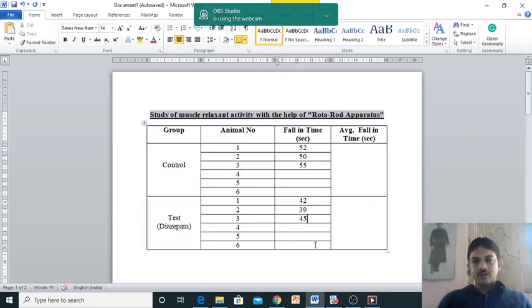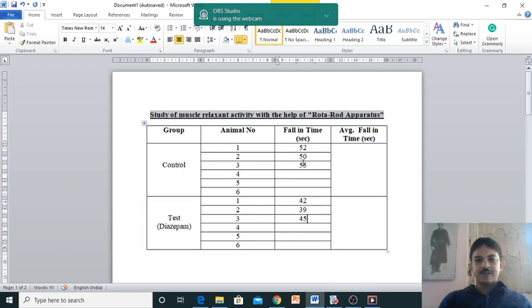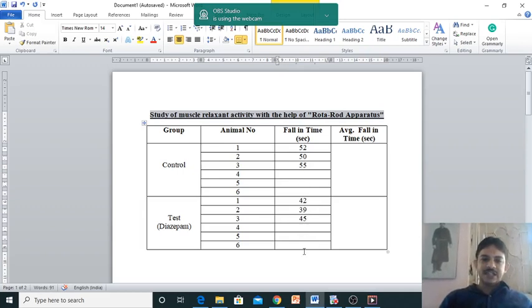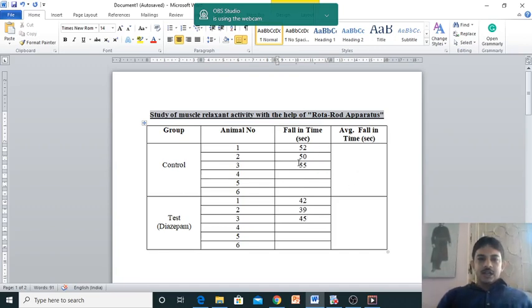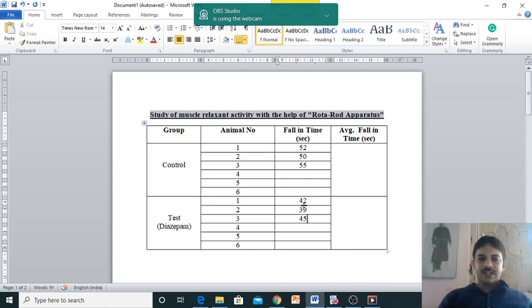Now here we have got three readings. Repeat the experiment so you will get six readings, then take the average time. If you see the control group compared to the test group, animals treated with Diazepam fall quickly. Why? Because of lesser grip strength.